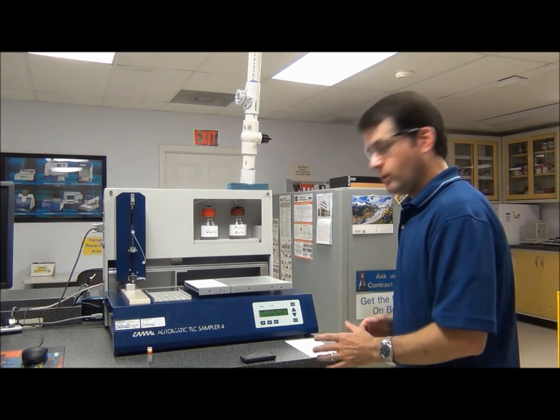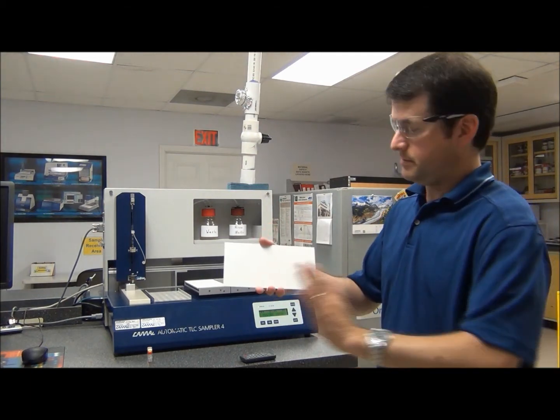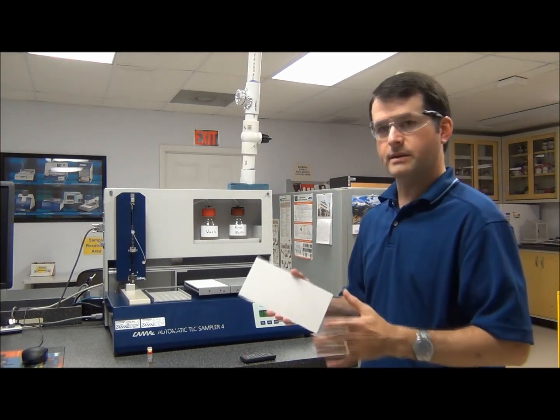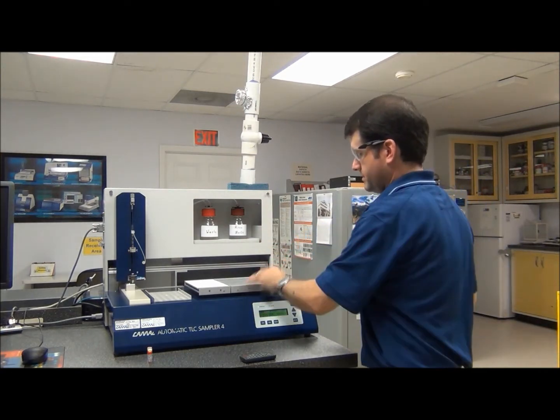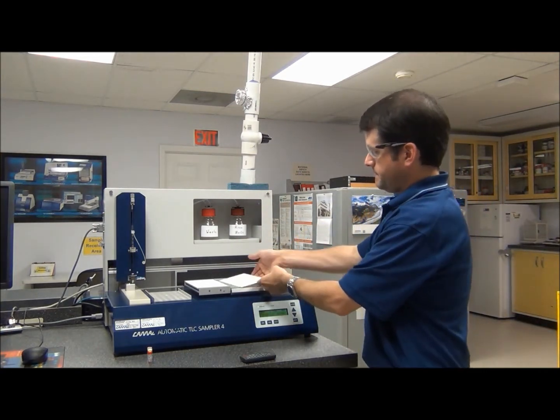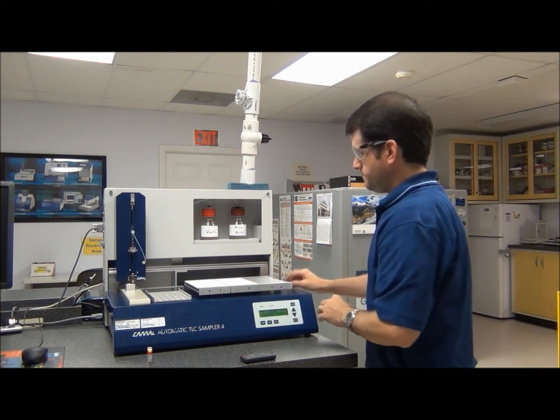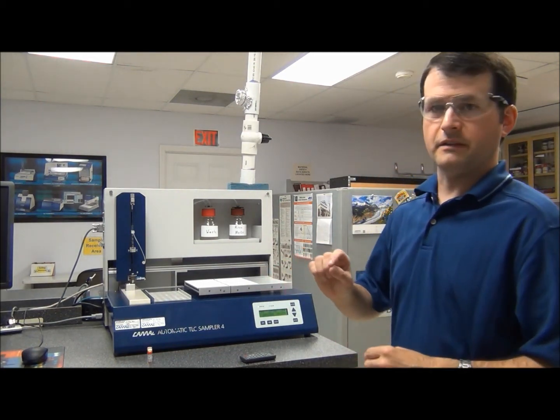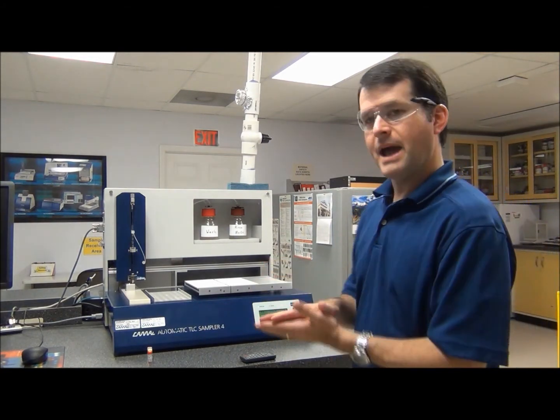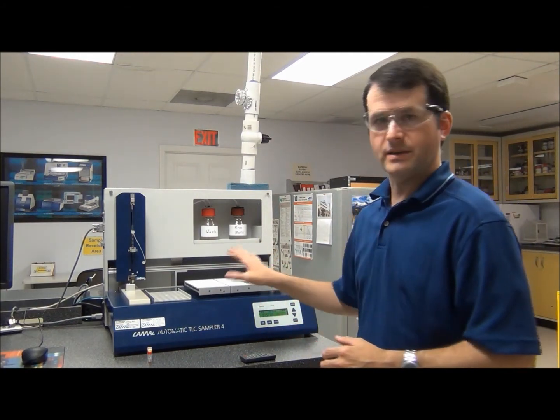What we're going to do now is load the plate onto the stage. Here we have our clean, blank plate ready to go. We've already acquired clean plate images of this. We're going to go to our stage, lift the lever, pull down the front, and load the plate. This is a self-adjusting table, so if you use different thicknesses of plates — plastic back plates or foils — it will automatically adjust based on the thickness and make sure the plate is always in the same position.